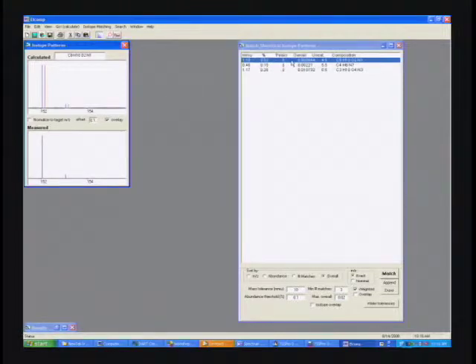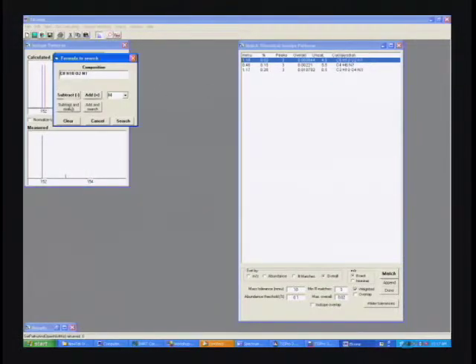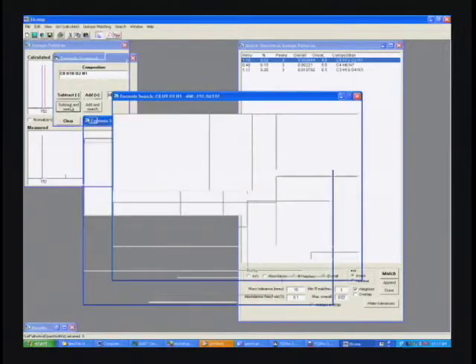So the software found 3 isotope peaks with an average 1 millimass unit error. The abundances match within 0.02%, and you wind up with a score, where the smallest score is the best match. So let's see if there's anything in the database that matches this formula. DART produces an M plus H plus in positive ion mode, so we're going to subtract an H and search the NIST library database to see what compounds show up.